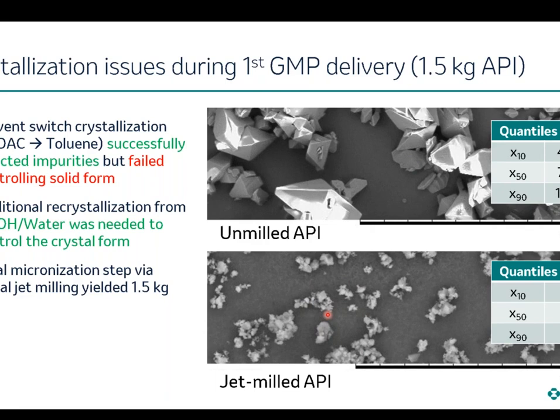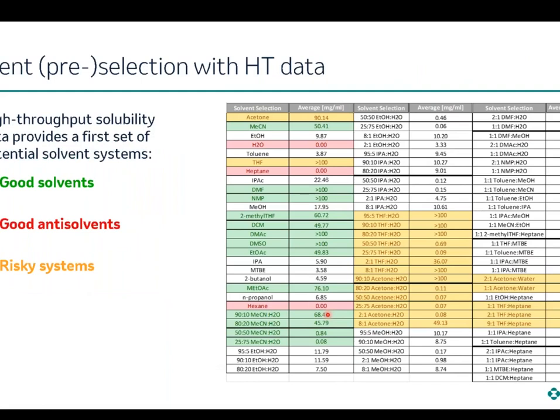Now, looking at what has been done, one thing we typically do is get solubility data for a broad variety of typical solvents in a high throughput manner. Here we have a robotic system which provides, in a 96-well plate format, solubility in different solvents and solvent mixtures, all at room temperature, along with solid form data if something crashed out or was analyzed, which is not shown here.